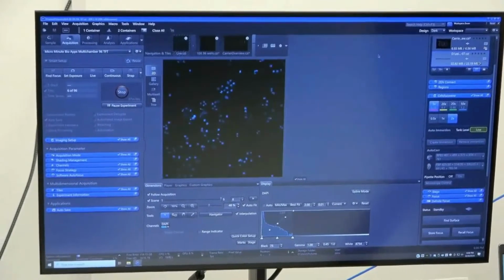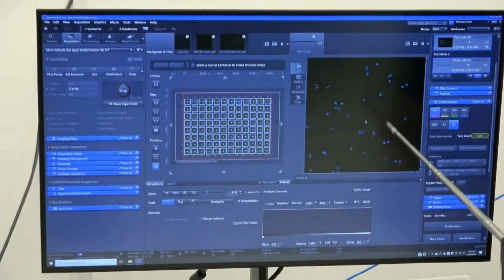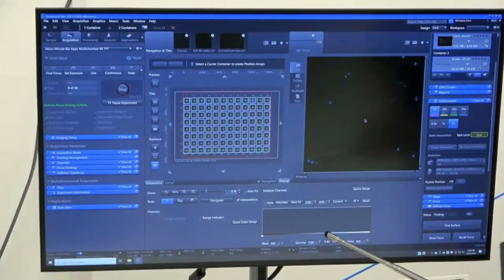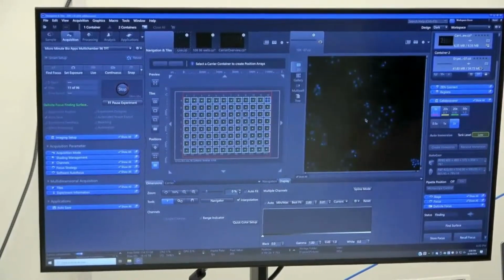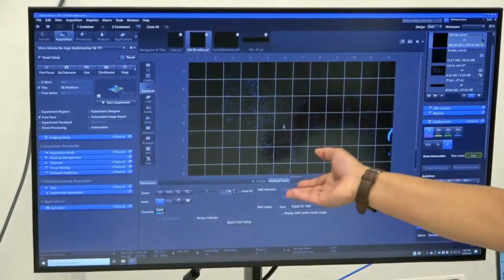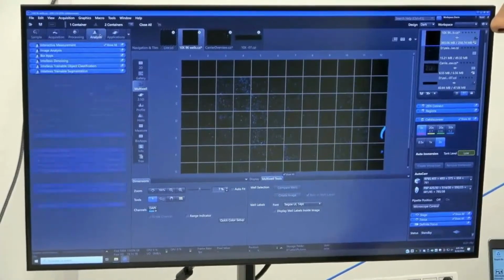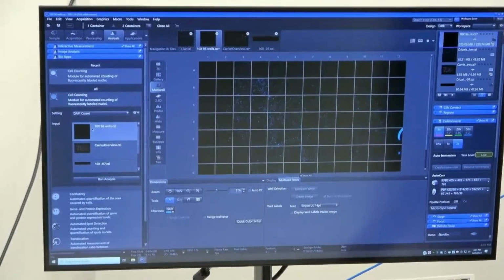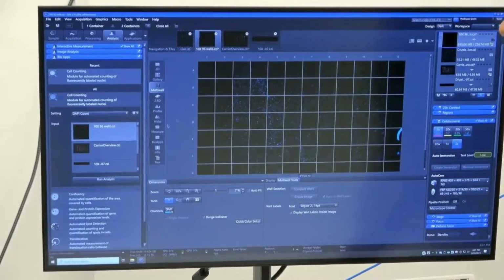I can do a 2-container view, and I can drag this over to just show you very quickly. It's imaging just a position per well and just the nuclei. So we'll just start very simple. It's going to go image all of the wells, and it's just imaging one channel in DAPI, and then it'll go on to do all of the 96. In this image that I already captured, all of the 96 wells were captured for the DAPI channel alone. Now, manually, I could walk over to the analysis tab, and utilizing one of our cell count bioapp settings, I can apply a cell count analysis setting, run analysis, and get a DAPI count for all of these 96 wells that we have captured.